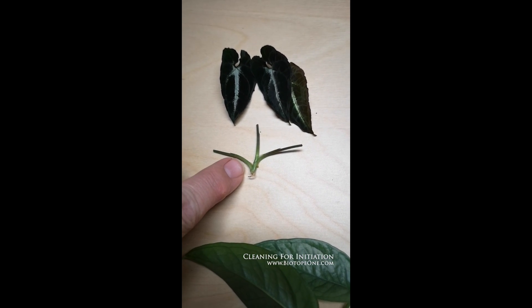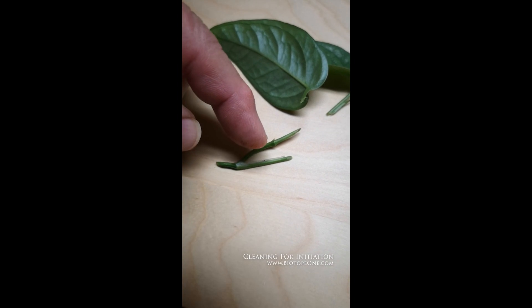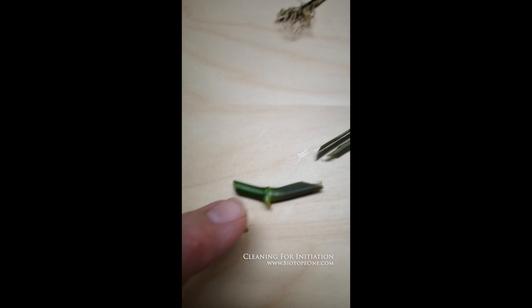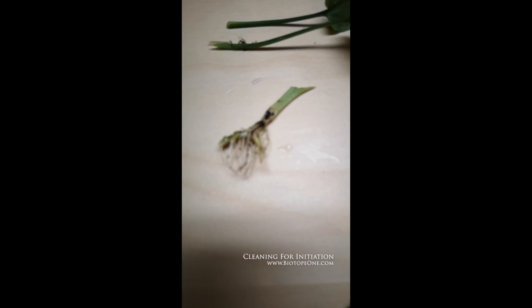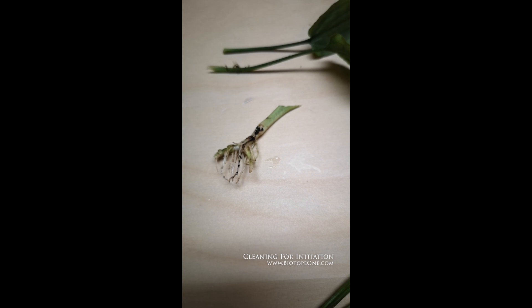I'm going to cut this down pretty close to the nodes — each of them. I can get two nodes out of this: this one here and this one. And this one is a single node here — that's a pretty big one. The only one I'm really worried about is the Cryptocoryne, because as you can see it was down in the growing media and there's a lot of bacteria.